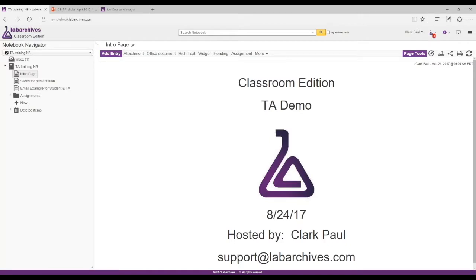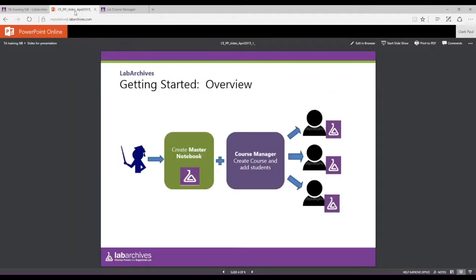Thanks for joining me today. My name is Clark, a member of the product training staff here at Lab Archives. This is going to cover our Classroom Edition platform — specifically what the TA needs to do. The instructor has created what we call a master course notebook and uses a course manager to connect this notebook to their course. In this course manager, they add their students and their TAs and sections.